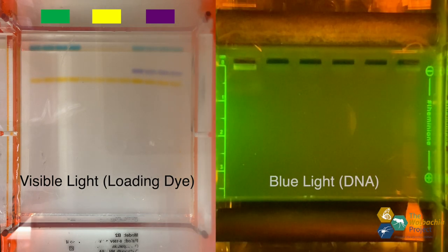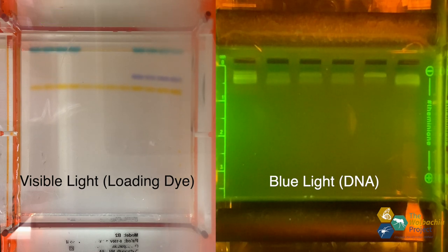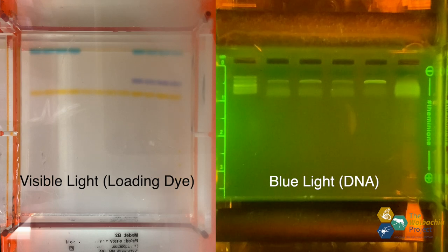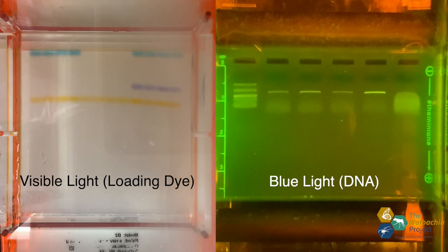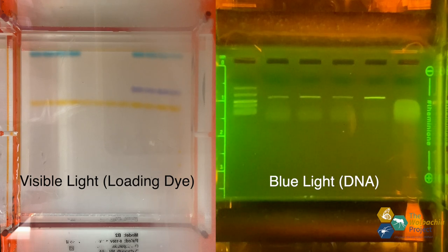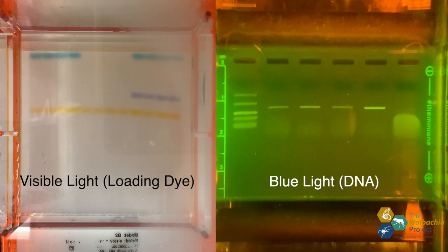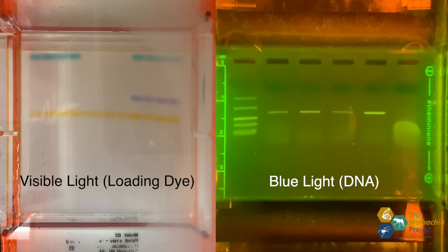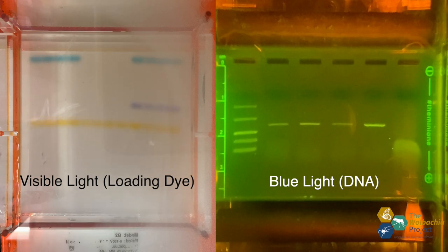Loading dye doesn't directly correlate with where the DNA is — it just gives us an idea of where our DNA is, so we can separate it enough to see size differences without running it off the gel. I'm using a gel green DNA stain to visualize our actual DNA with blue light. If you look closely, you can see the blue loading dye running behind the DNA.